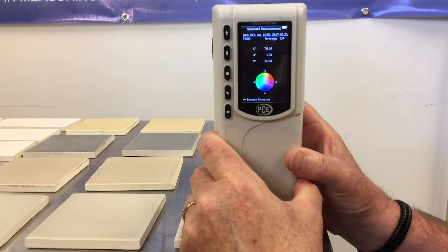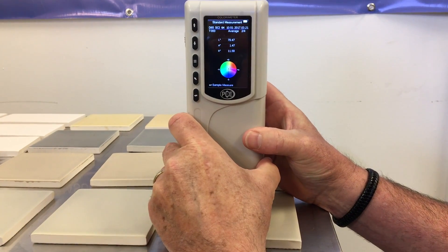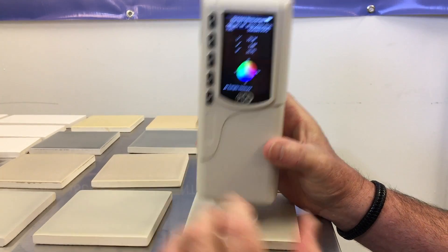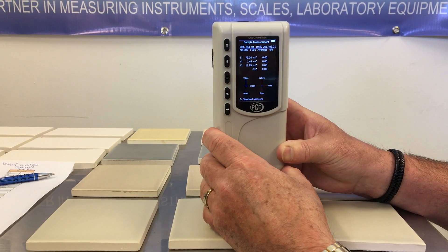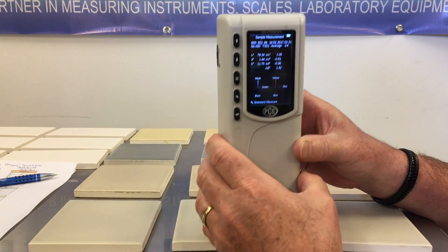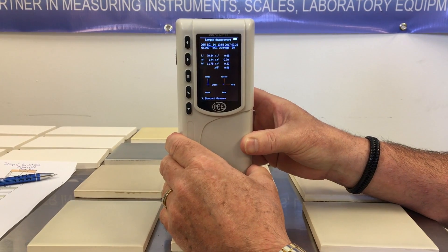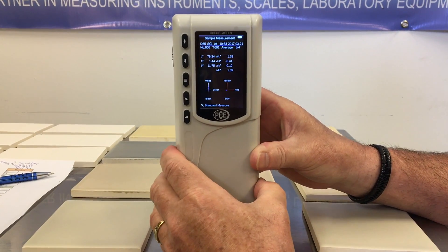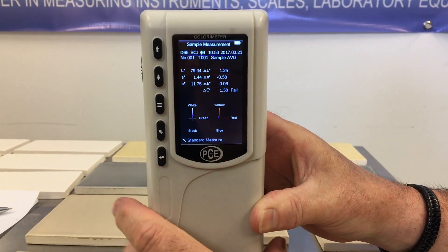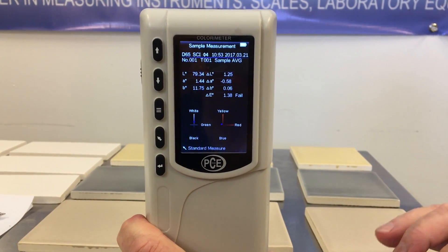We're going to do it four times: one, two, three, four. Our average is set for our standard. Now we're going to check the samples. This is our first sample: one, two, three, four. Notice that it says delta E failed — this color failed by 1.38 delta E from the previous color, which was our standard.